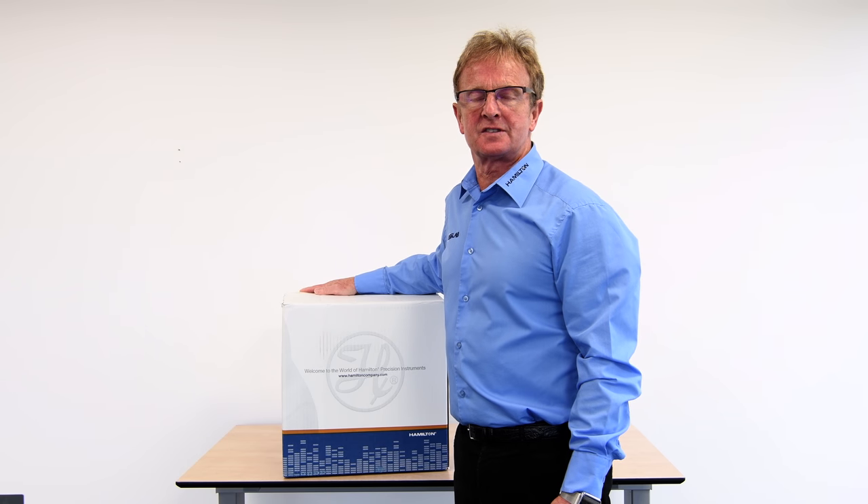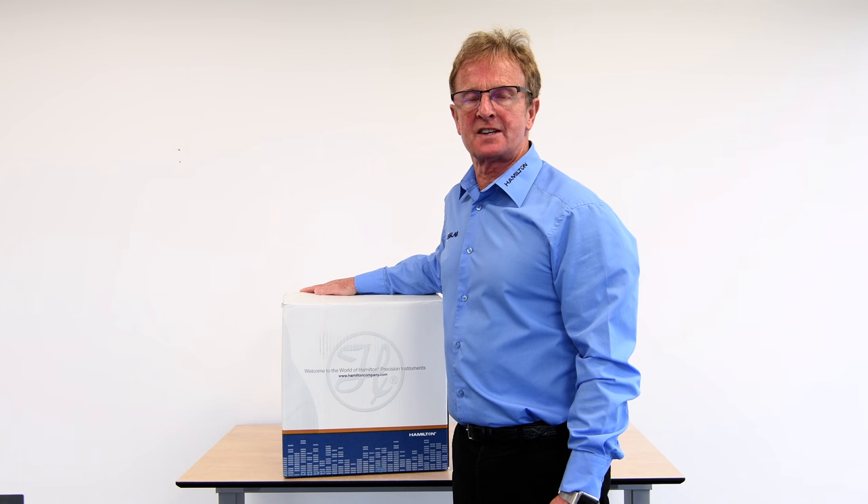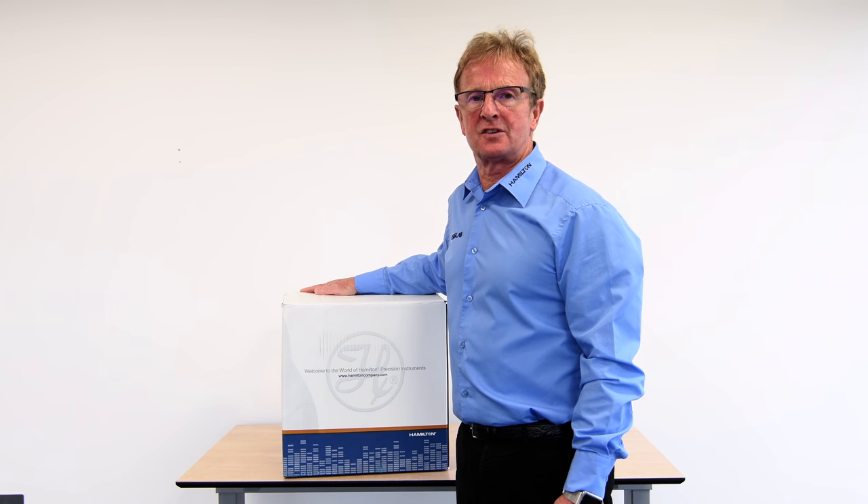This video forms part of a series to include instrument setup, functions and applications.